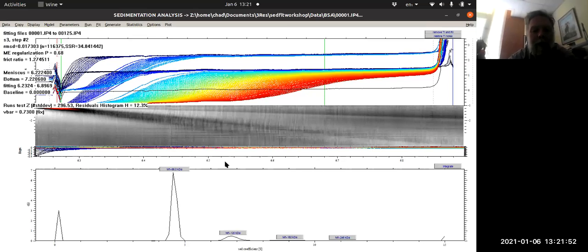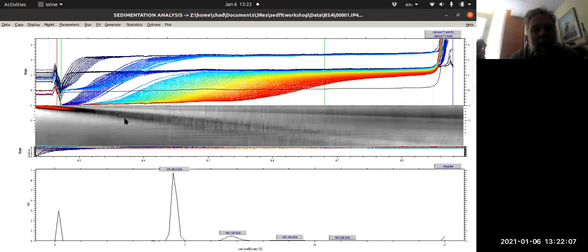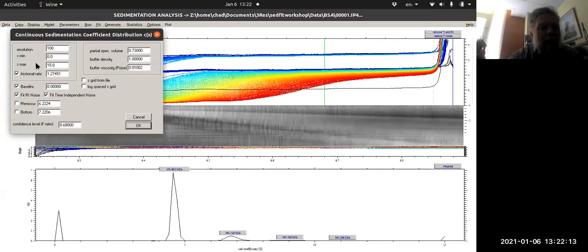If I display the molecular weights, they've actually changed a little bit. Now it's telling me that my main peak of BSA is rolling in at about 66 kilodaltons. And since I'm running BSA, that's about what I expect. I think when I do my final fit, it ends up being a little bit smaller than that, and I'm not really sure why.